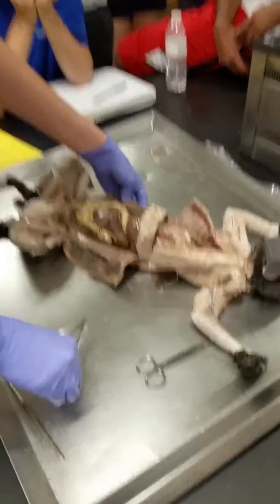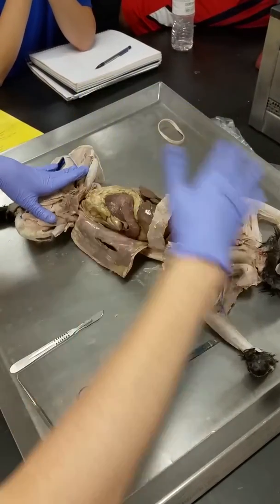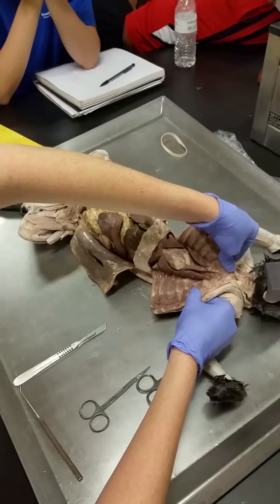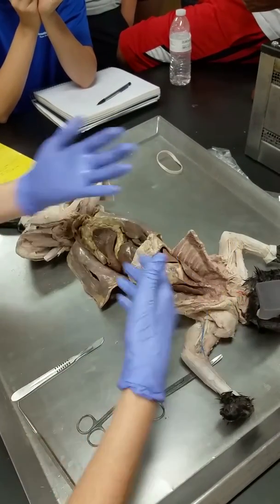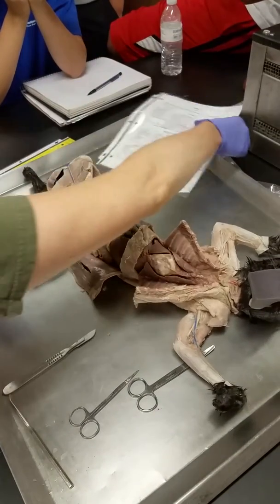Okay, just like that. So now we've got thoracic cavity and abdominal cavity. Everything's exposed. And so far he looks nice, which is good. Or she. Bill's a she this time. Sorry. Okay. This is why they're in plastic, because then I can rinse them off.